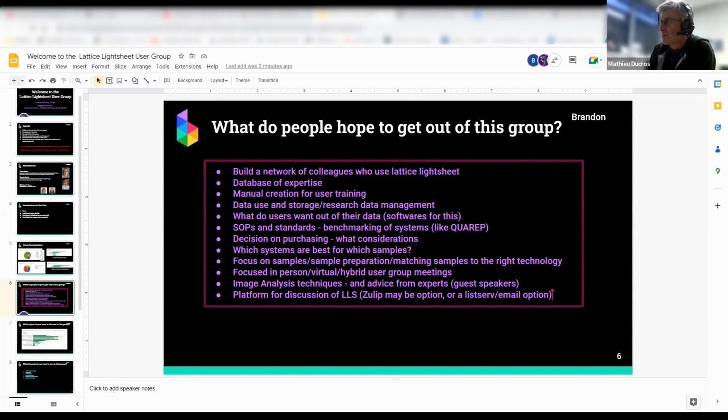It's a Google group, and I think if you join the HHMI Advanced Imaging Center, you can ask to be registered and have the mails from this group. It's especially useful if you have a home-built Lattice Lightsheet, obviously, because they talk about special parts and hardware modification, but also about software and things like that. So it could be interesting for the whole community.